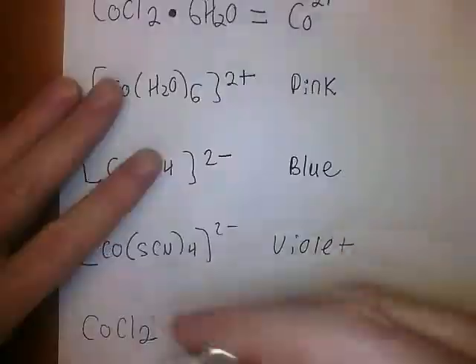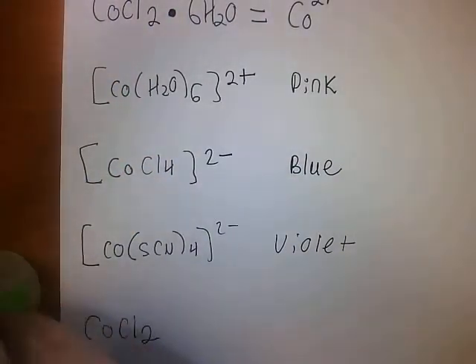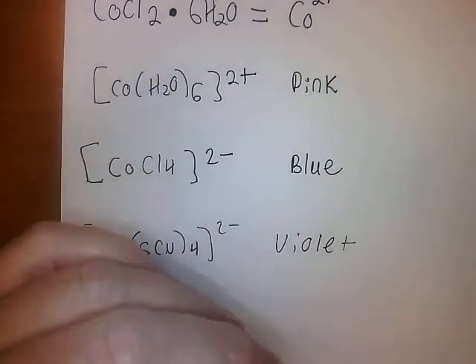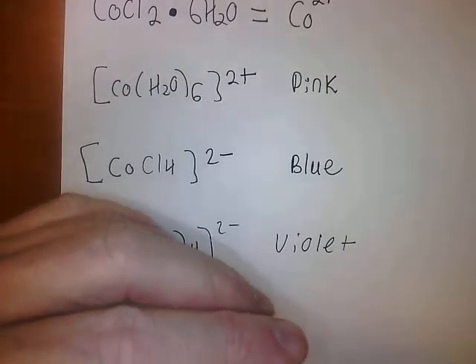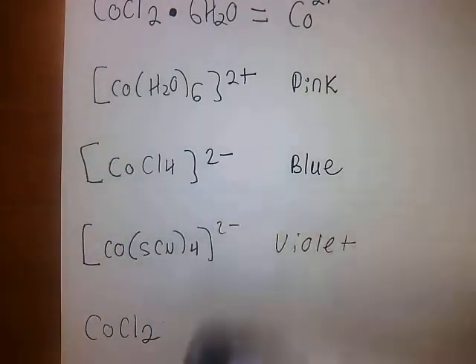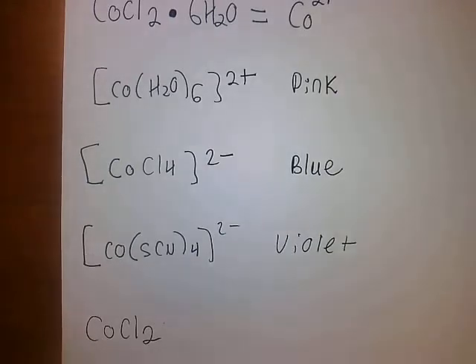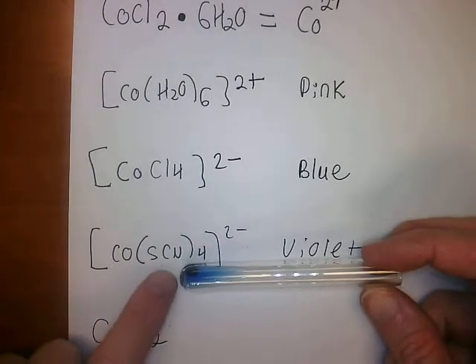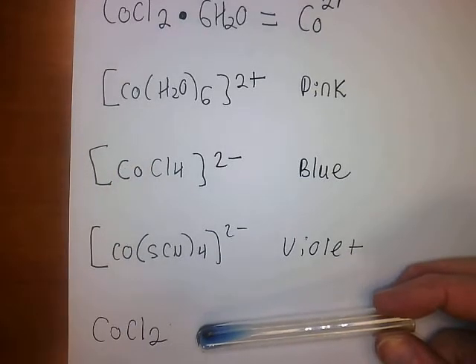So this very last one here, what we're going to do is add some ethylene diamine to this. I'm sorry, not ethylene diamine, ethanol. We're going to attempt to dissolve this up in ethanol. It'll be somewhat soluble. I doubt it will completely dissolve. But if we shake it up enough, we can get some of it into solution, and it's forming a blue-colored solution, somewhat similar to what we got up here with the tetrachlorocobaltate.